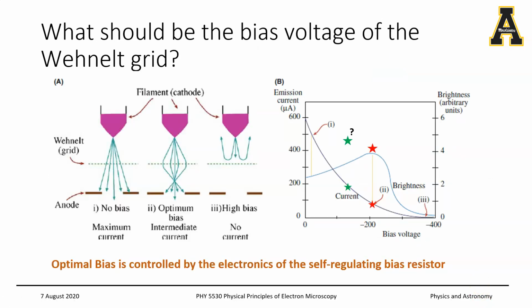Okay. Now, the Wehnelt cylinder is critical in focusing and making sure that you collect as many electrons as possible at the crossover point. But it is also important that you realize that the biasing of the Wehnelt cylinder is critical, simply because, let's take a look at this figure here. You have the anode. So the anode and the tip of the filament generates the potential for accelerating the electrons right through it. Now, if you have a Wehnelt cylinder that is unbiased, which means now the electrons are sprayed in a conical fashion, or that's a solid angle, right? Think of it in 3D, and then you lose a lot of them because the brightness is low, simply because not all of them are focused so that they pass through the anode. At the optimum bias, you focus them at a point and then they pass through the anode, and so that's great. That's what we are shooting for.